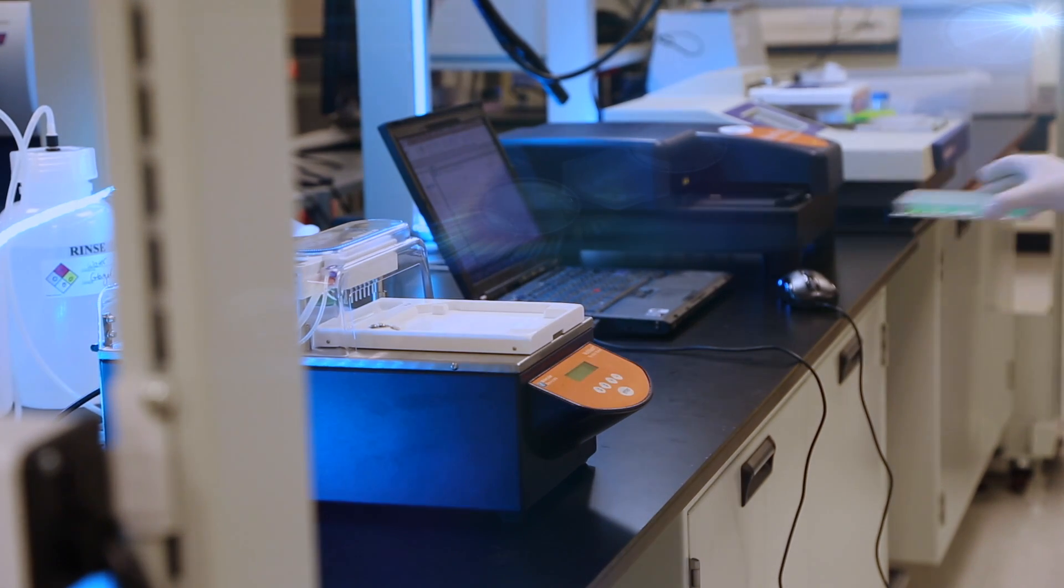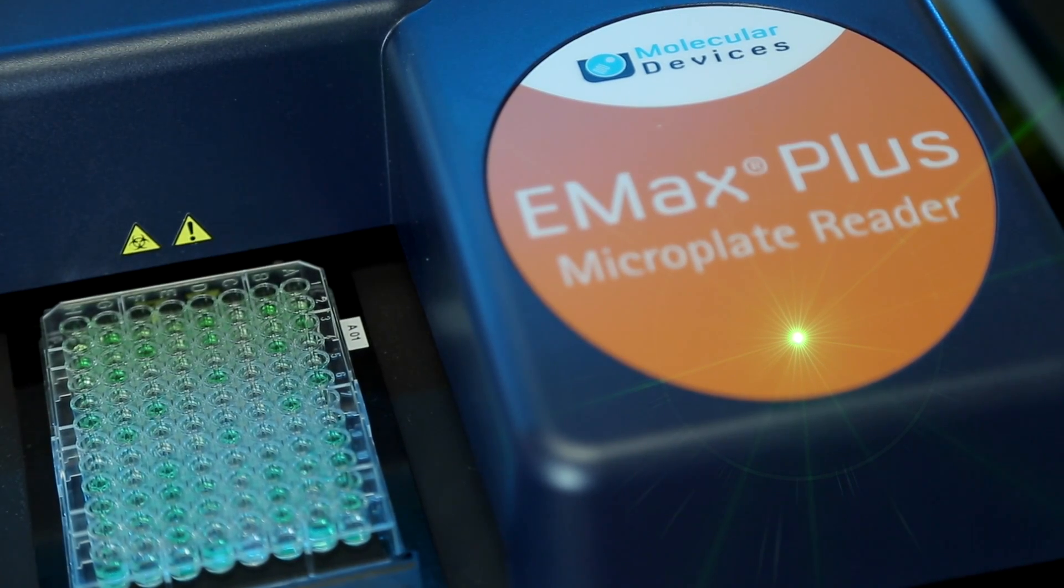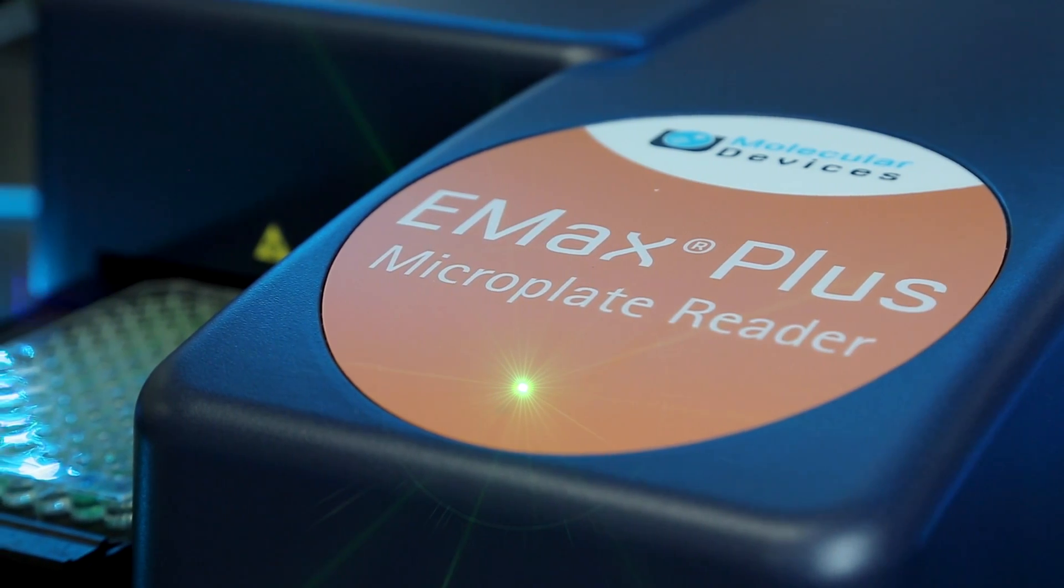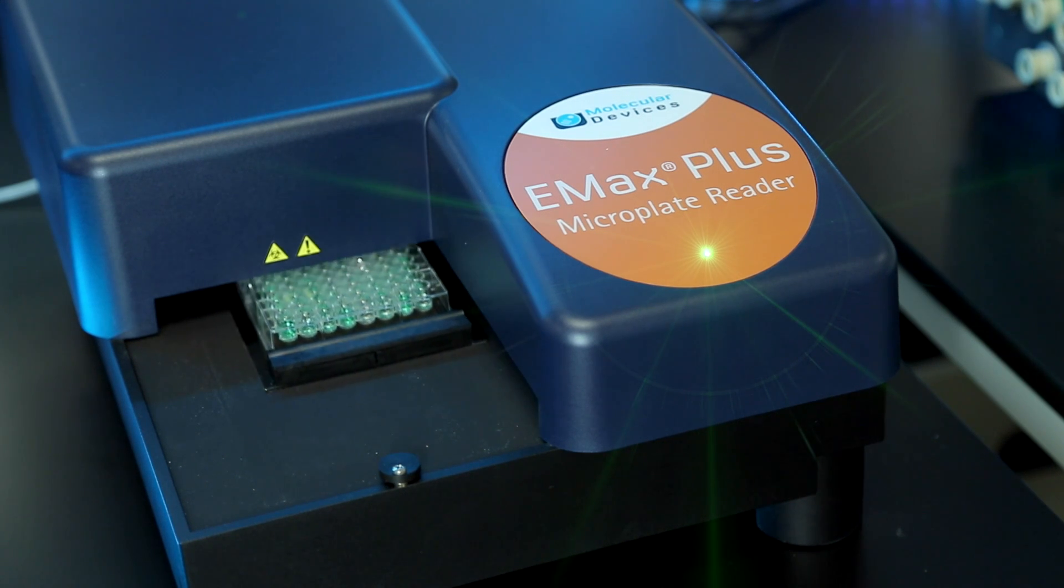After washing your plate, an ELISA plate can be read in the Emax Plus Microplate Reader. This new affordable compact reader comes pre-configured with eight filters that cover a wide range of applications, including many ELISA options.